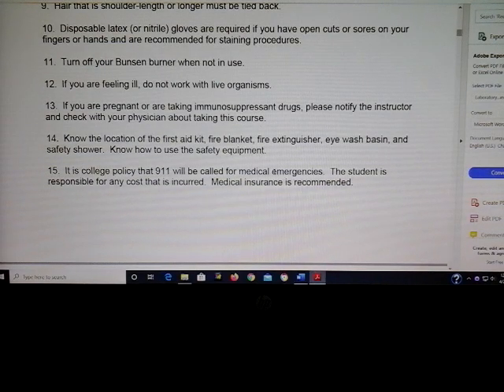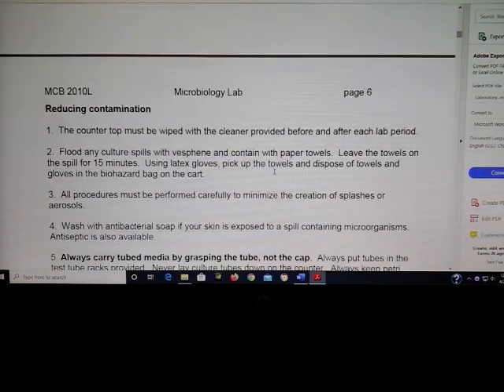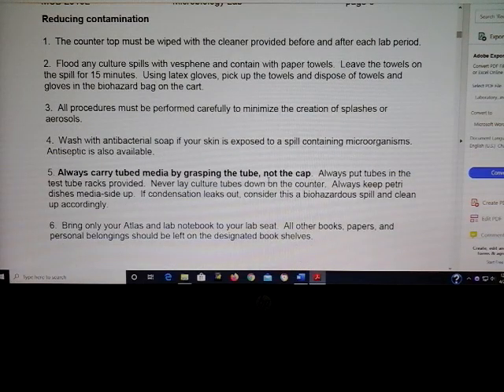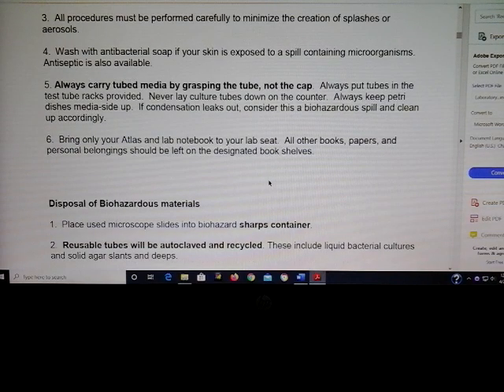Again, please look at the video on lab safety. It shows where all of that is in the micro lab. Now again, something to keep in mind, before and after lab, always wipe your bench down, should that show up on a quiz. Always wipe your bench down before and after class. Clean any spills right away. Don't worry about telling your instructor, mistakes happen, guys. You have to make sure you do it. You should always have your notebook with you and those kinds of things as well.